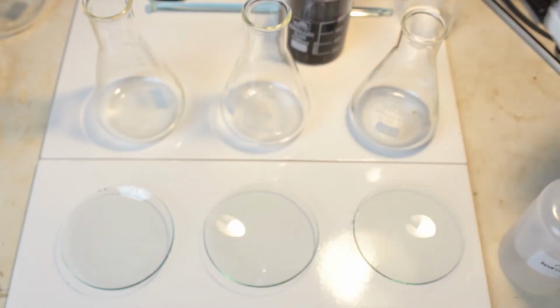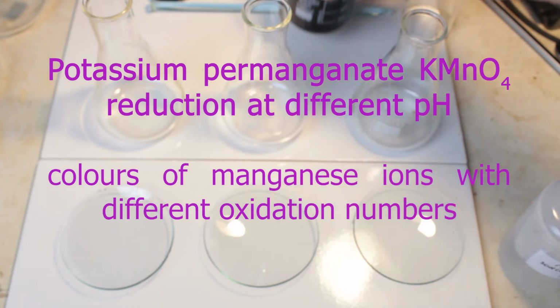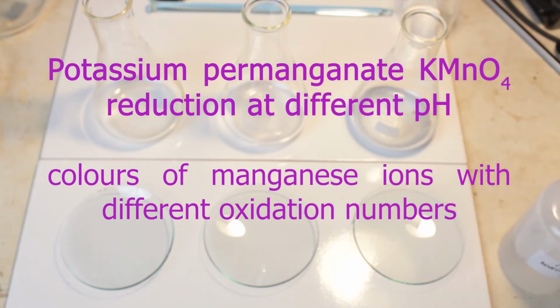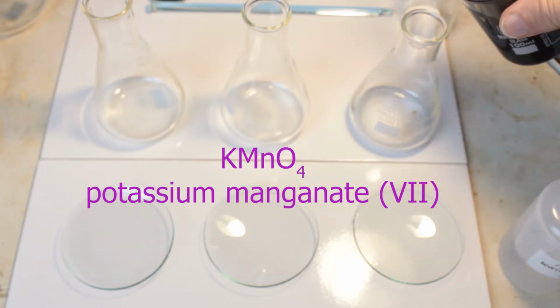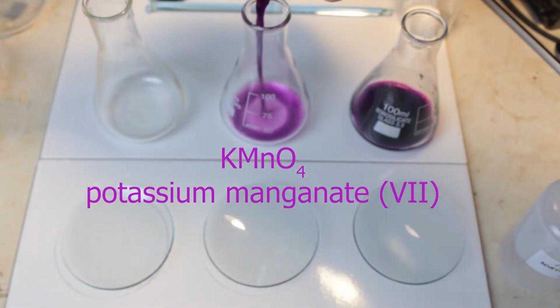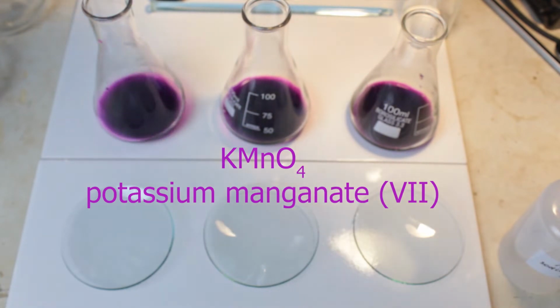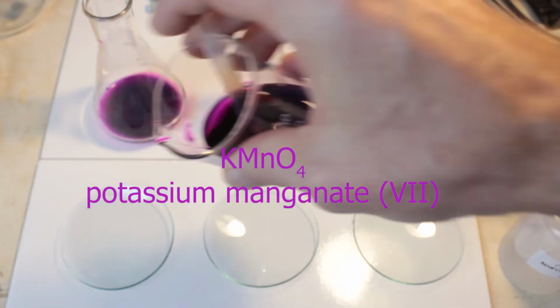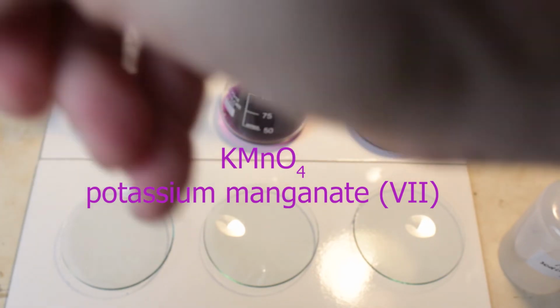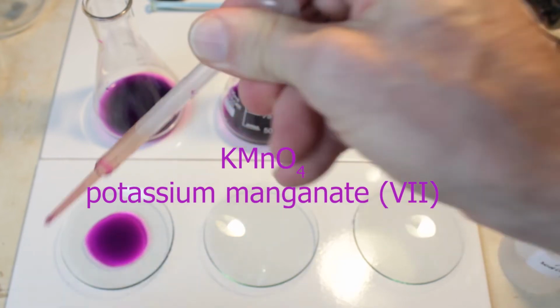Today we are looking at potassium manganate 7 and different colors of it. And especially we are going to reduce it at different pH. So, what is potassium manganate 7? Purple solution at high concentrations looking almost black. Oxidation state of manganese ions there is +7. When it is going to be reduced, oxide ions would be removed from the complex.